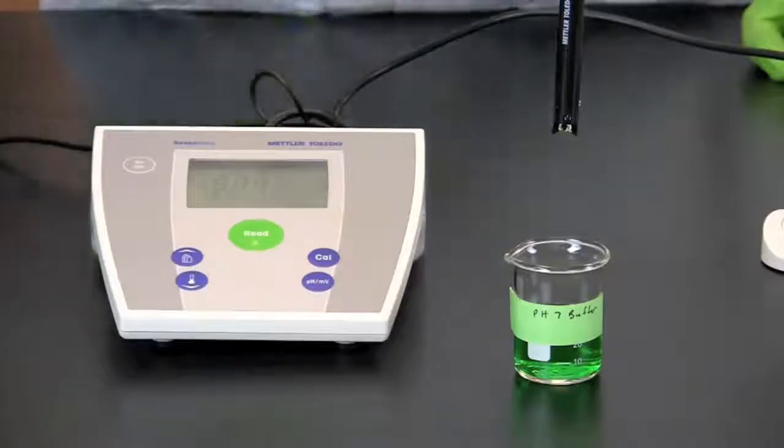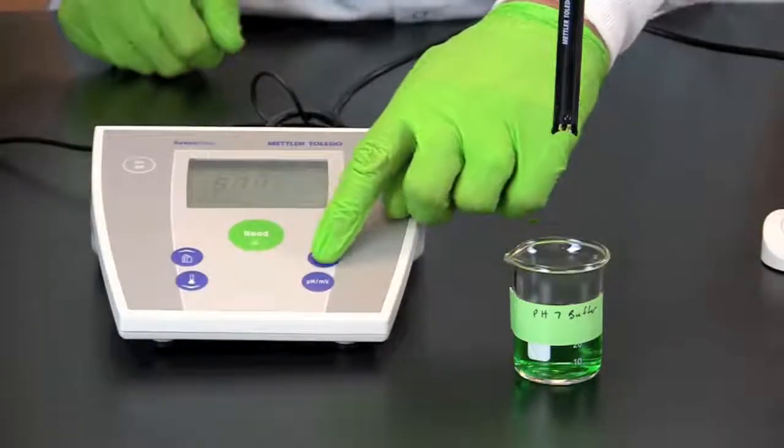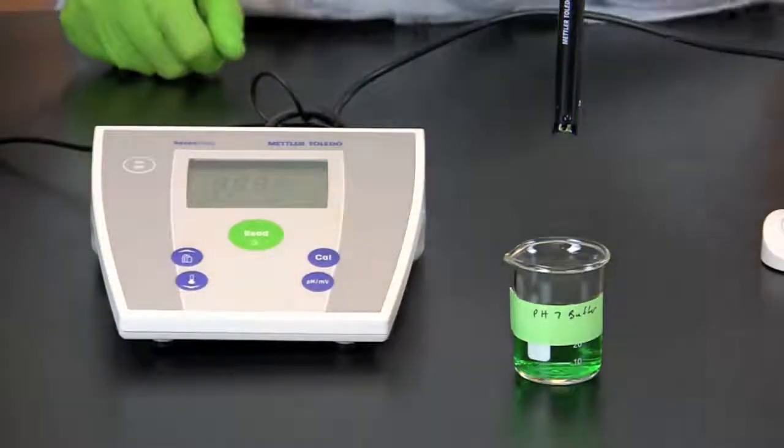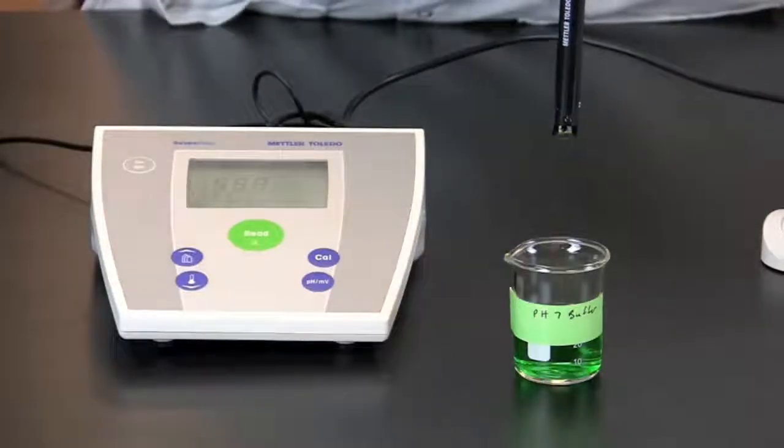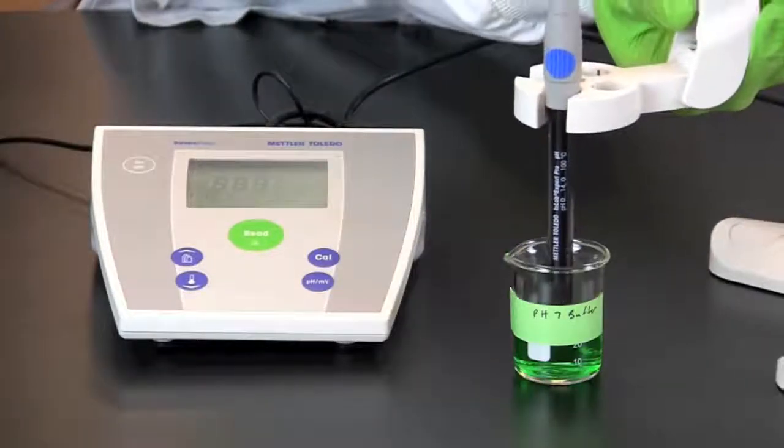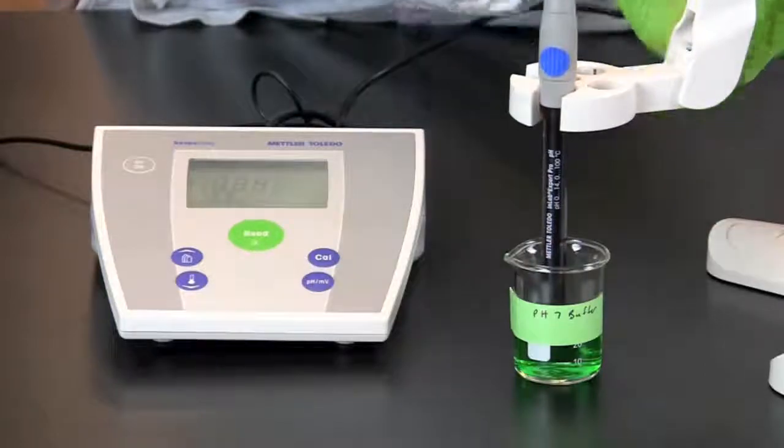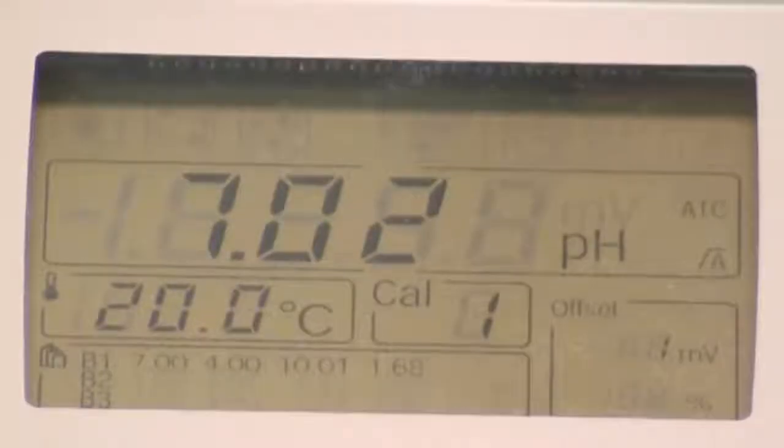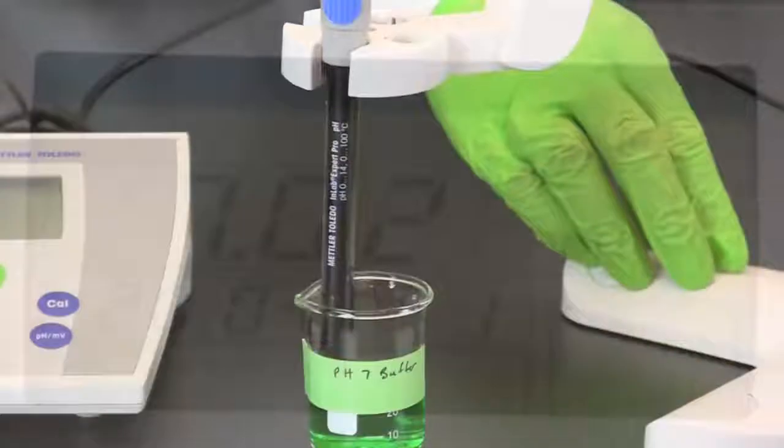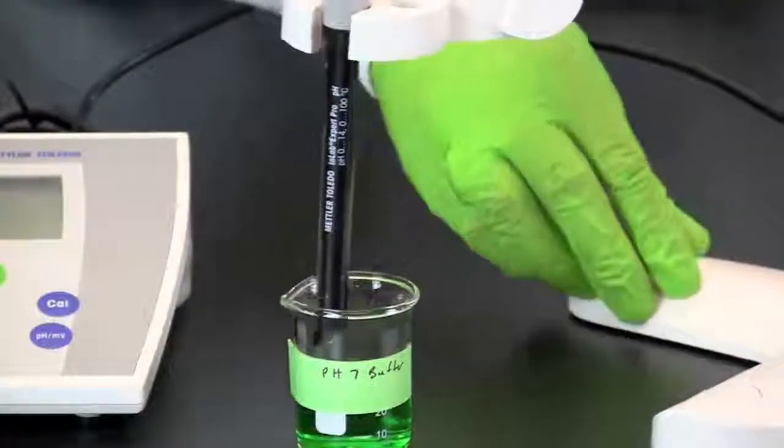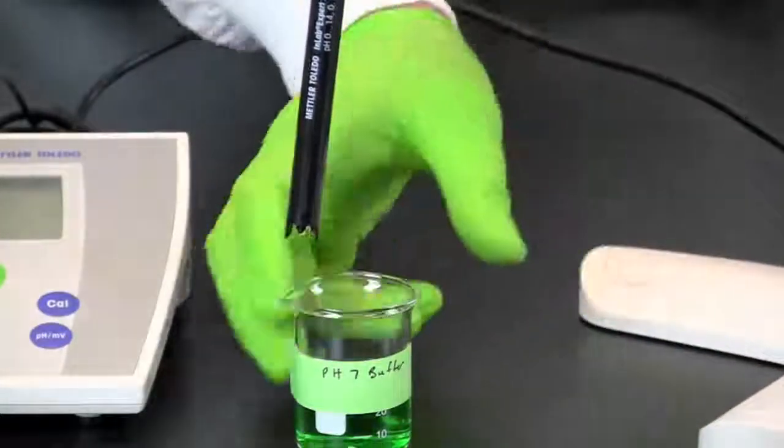Begin the process of calibration using the standard with a pH of 7. Once the standard has been calibrated you will need to remove the sample and rinse the electrode with distilled water.